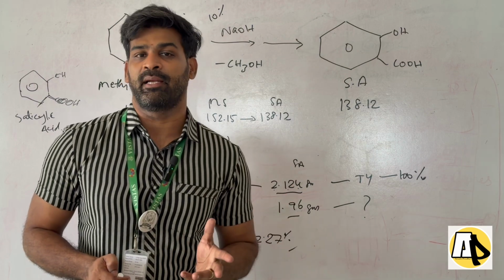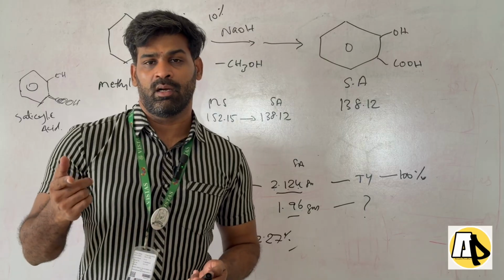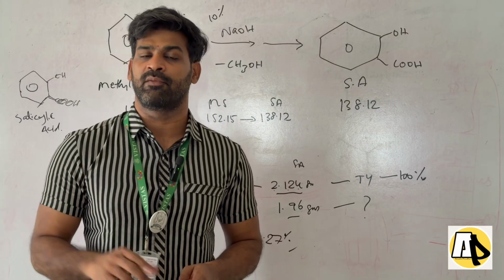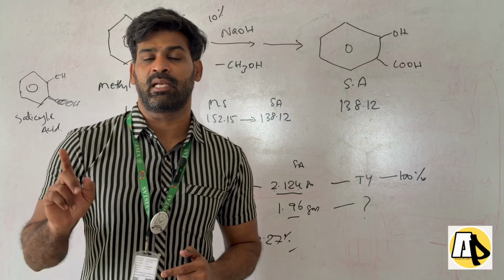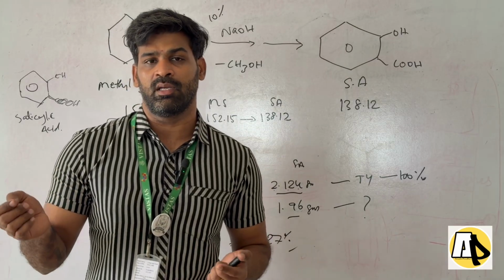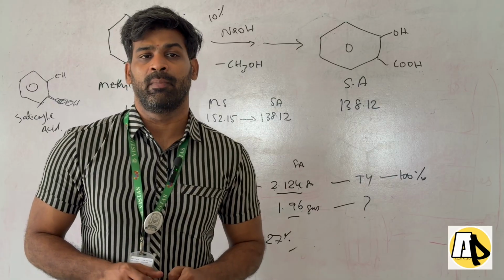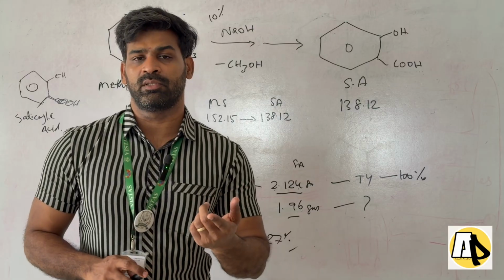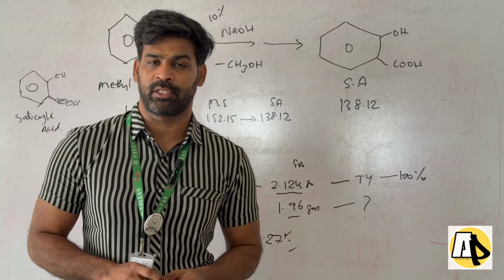That will cause blindness. And one more important thing you must consider while doing experiments: while handling concentrated acids like sulfuric acid, always be very careful. Use clean glass utensils and clean glass instruments only while using concentrated acids, because plastic, stainless steel or rubber will cause corrosion.